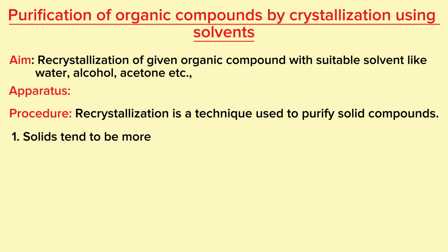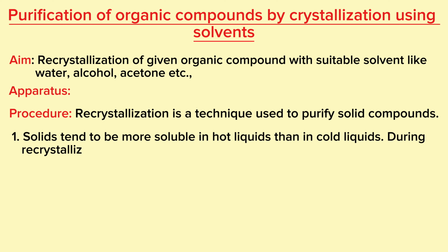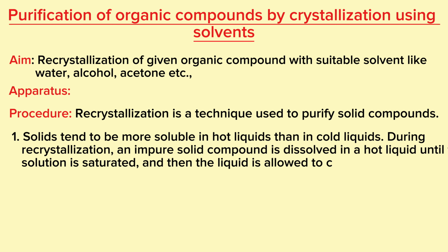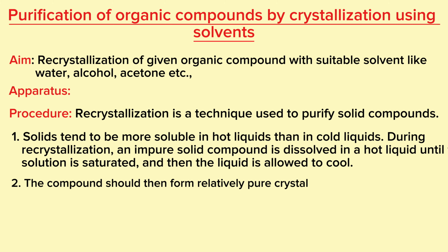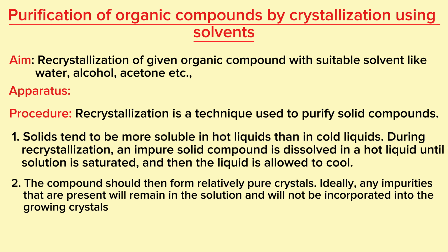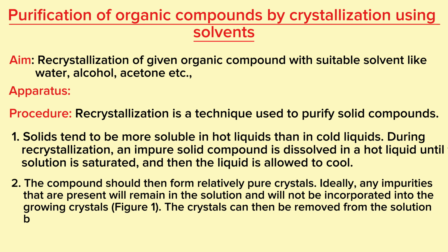Solids tend to be more soluble in hot liquids than in cold liquids. During recrystallization, an impure solid compound is dissolved in a hot liquid until the solution is saturated, and then the liquid is allowed to cool. The compound should then form relatively pure crystals. Ideally, any impurities that are present will remain in the solution and will not be incorporated into the growing crystals. Figure 1. The crystals can then be removed from the solution by filtration.